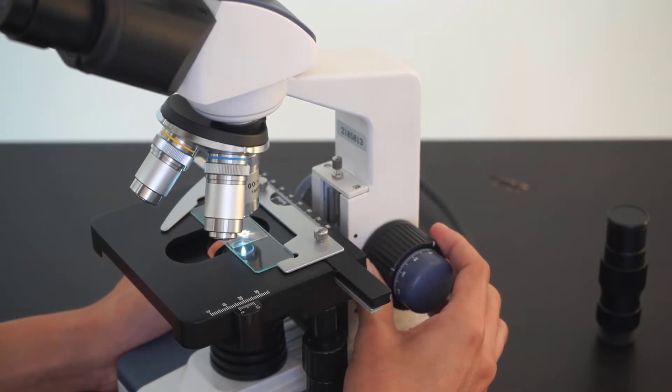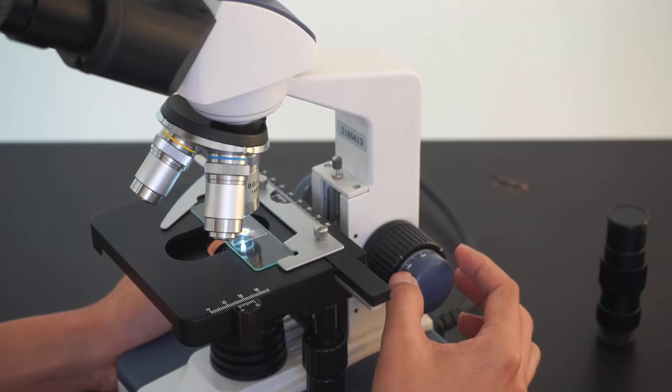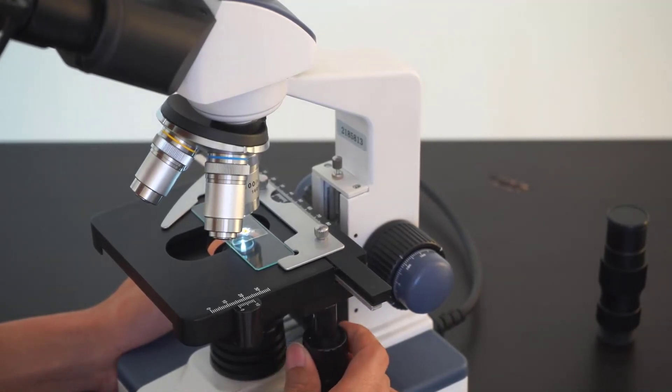This would be the larger focusing ring, and there is a precision focusing ring which you can use to precisely focus. To move the stage, we just need to turn the knob on the stage.